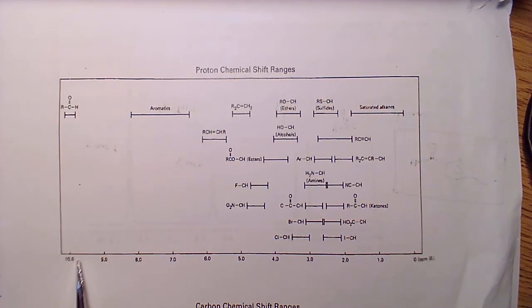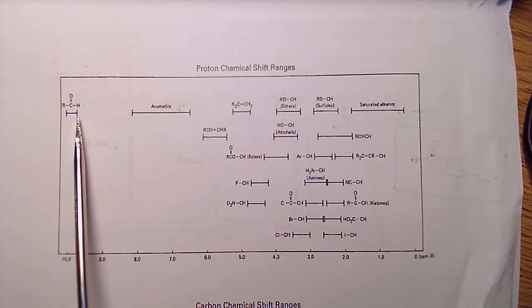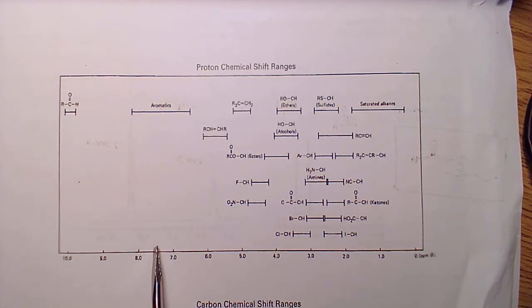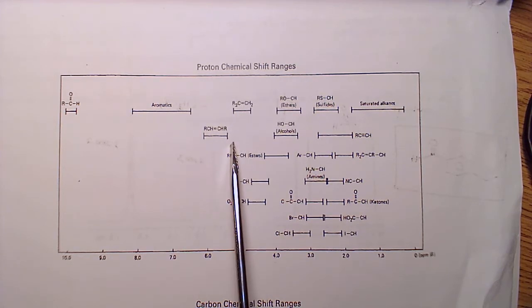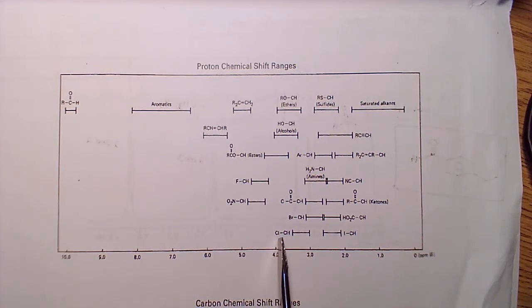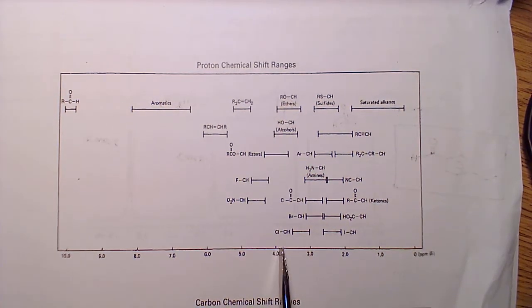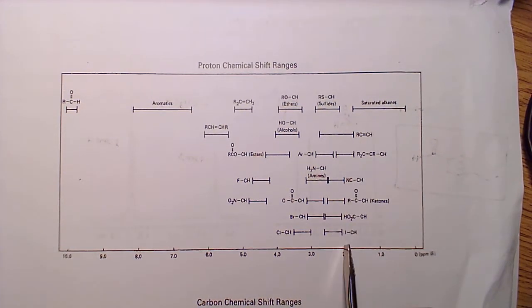And we're going back to look at proton just to show how we've got carbonyls, aldehydes, carbonyl compound, aldehyde here, close to 10, aromatics around 8, on the left-hand side. In the middle, we've got, well, not too much. To the left of the middle is double bonds, hydrogens on carbon and double bonds. To the right, around 4, we've got hydrogens on carbons next to alcohols and ethers, oxygen-containing compounds. And then you have your halogens, amines, aromatics, carbonyls, and then your saturated stuff over here.